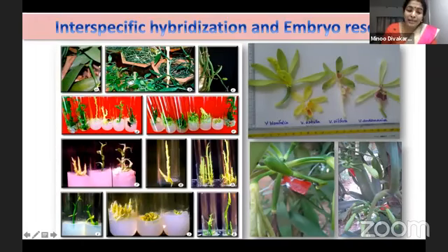And our results yielded quite a few hybrids, and many of them showed the distinguishing morphological differences even inside the culture tubes. So these variations were visible in vitro itself. They were raised, and the characters of leaflessness of the male parent had introgressed into the planifolia.